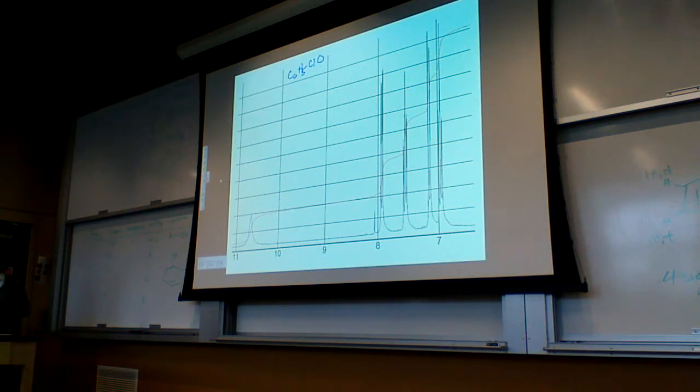Sheldon? Is it possible for the order of those to be different, like doublet, triplet? Yeah. So you note, if you were to go around the ring, it's doublet, triplet, triplet, doublet, and they can show up in any order. You just want all four of them: 2 doublets and 2 triplets within the 4 signals. Otherwise, we would see a singlet, a doublet, and a triplet.